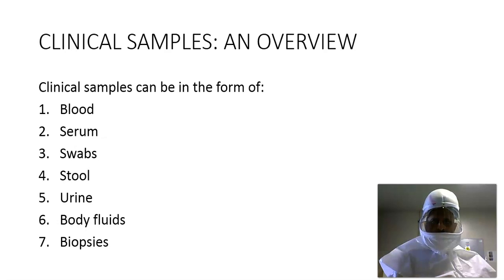Clinical samples can present themselves in many ways. They can be in the form of blood, serum, swabs, stool, urine, body fluids, or biopsies.